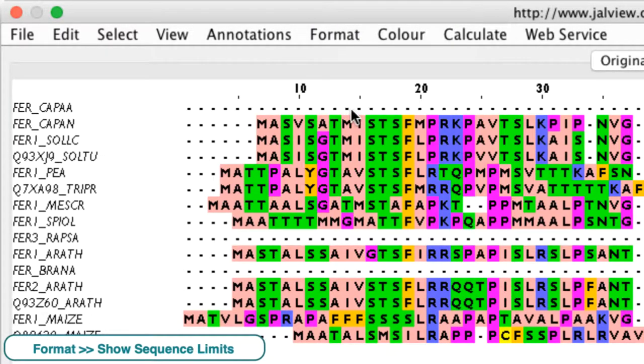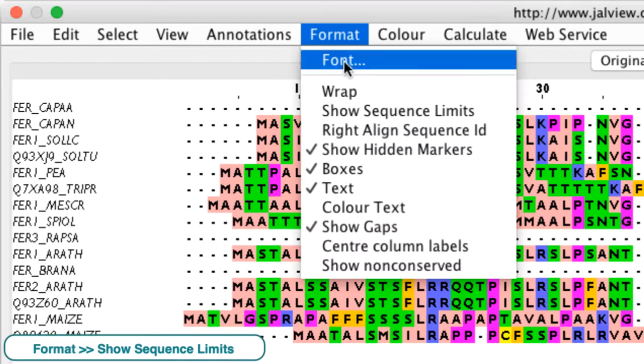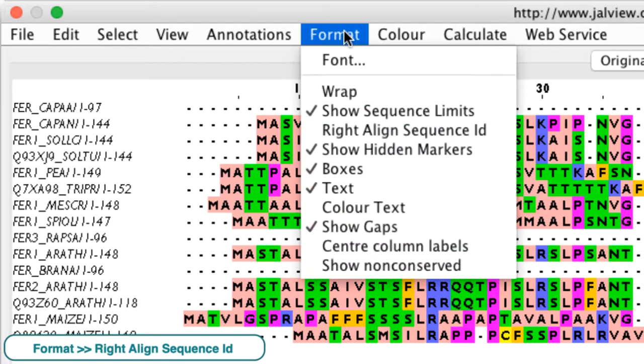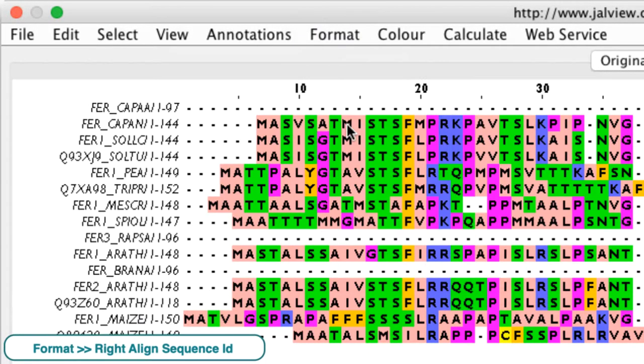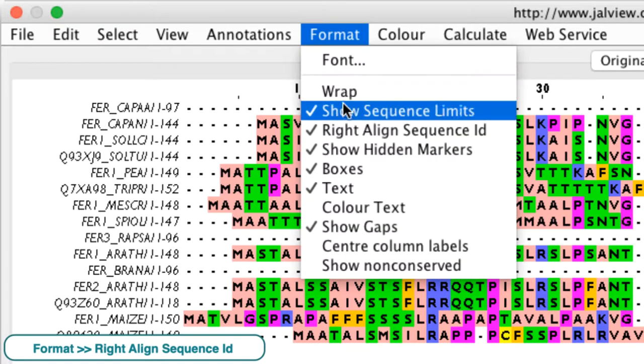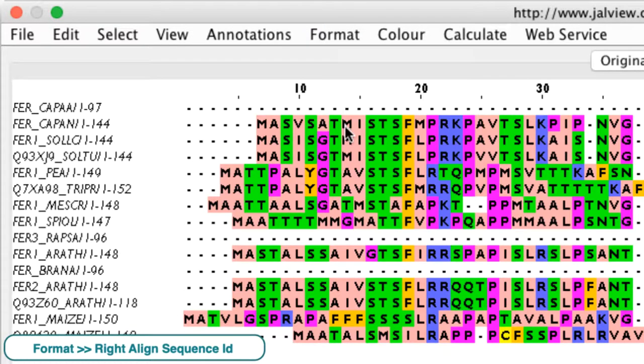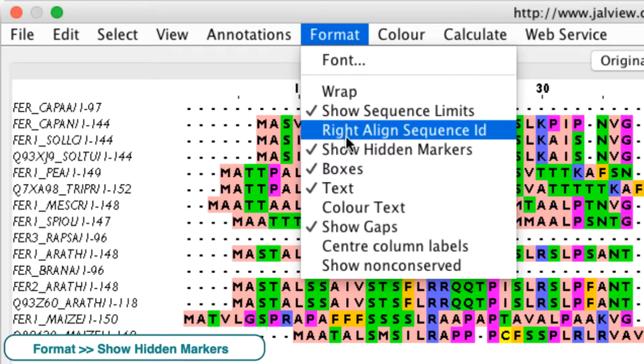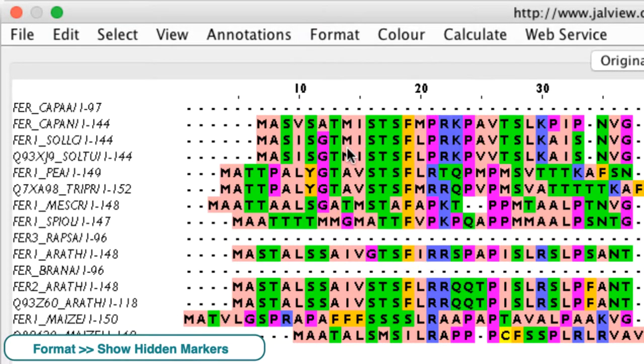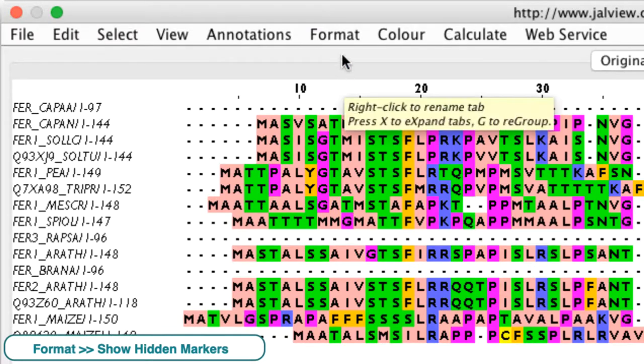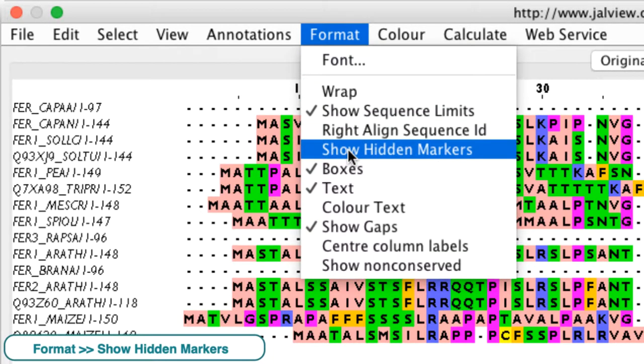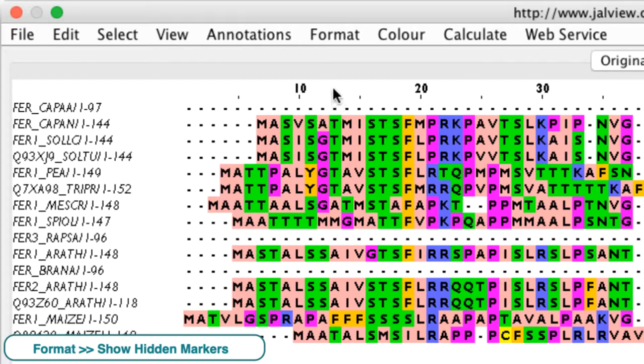Show sequence limits adds the start and end position of the sequence to its name in the sequence panel. Write a line sequence ID will change the position of the name in the sequence ID panel. Show hidden markers reveal or hide the blue arrow that appears when a row or column is hidden.